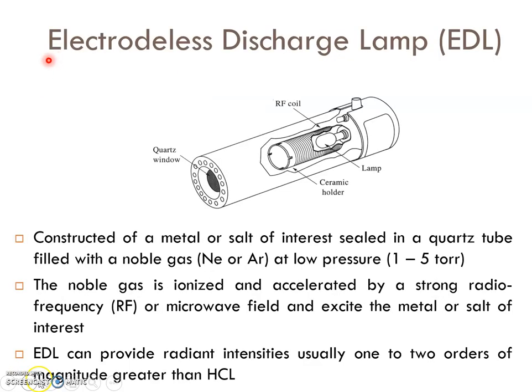Again, in this slide, we will look at the electrodeless discharge lamp, or EDL. This is a diagram showing an EDL. It has a quartz window. Again, the material must not absorb the radiation source. If not, it will introduce error in our analysis.